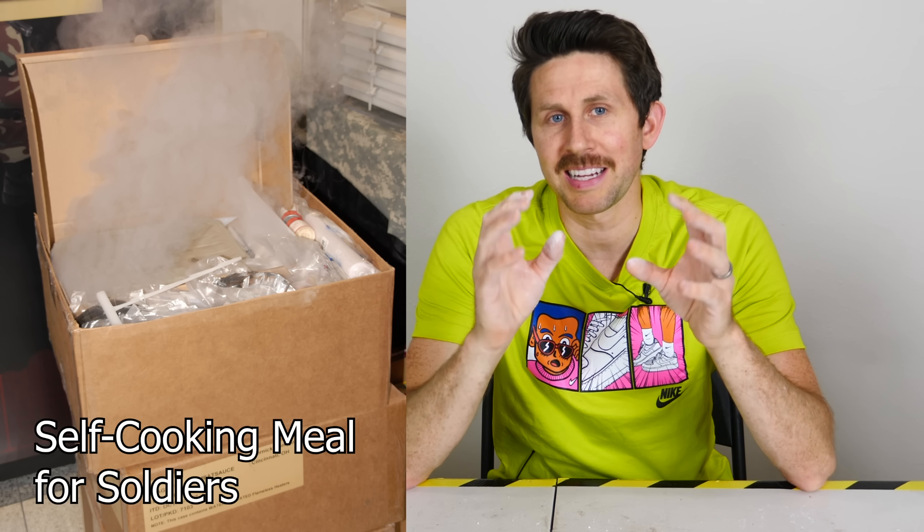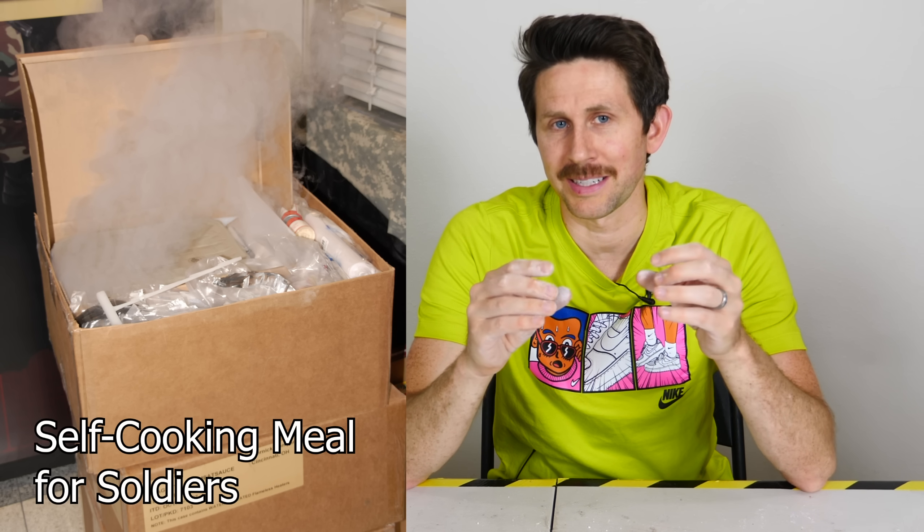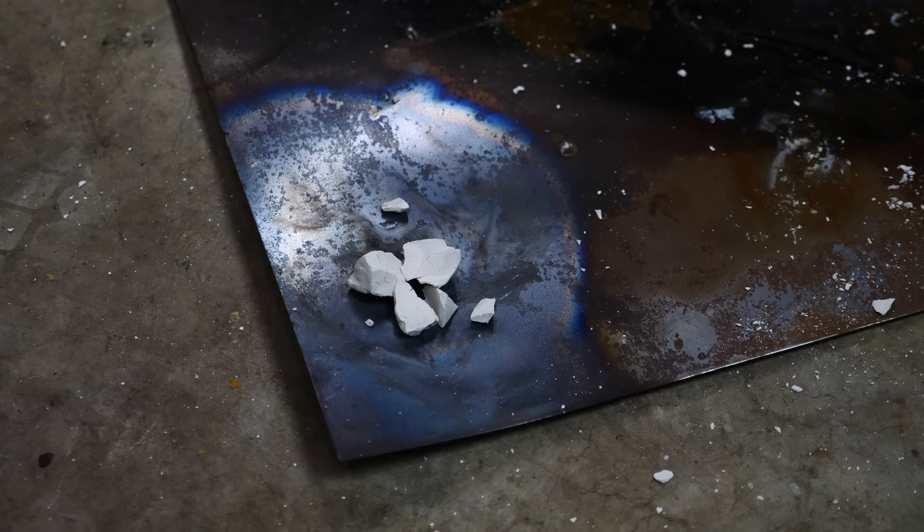Another cool thing is that when you're heating the chalk and it becomes calcium oxide, the calcium oxide, when heated to at least 2400 degrees Celsius, emits an extremely bright white glow. That's actually called the limelight. I'm going to turn the exposure down so you can actually see this bright light — watch how bright this gets.